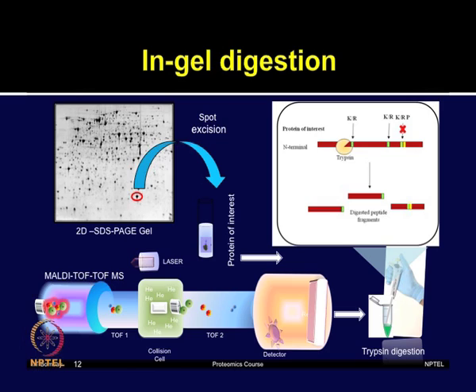If you want to analyze the sample even from the gel free proteomic based approaches, it is often a good idea to separate the protein complex mixture on the SDS-PAGE gel, excise the bands and then extract the proteins from that, and perform the in-gel digestion, so that you can simplify the proteome and increase the overall proteome coverage. So, a similar protocol can be modified and used for various types of applications in proteomics.